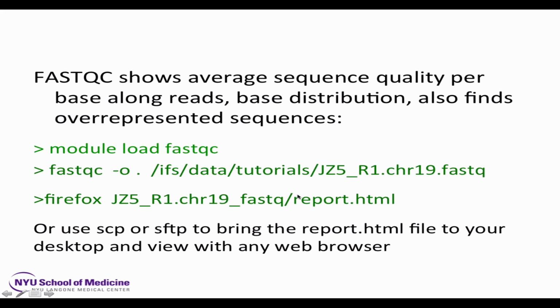Right, and then this may work. It works on Macs if, when you logged in originally, instead of typing ssh, you type ssh minus capital X. It's possible to remotely launch the Firefox browser and view the HTML in an X Windows remote session.